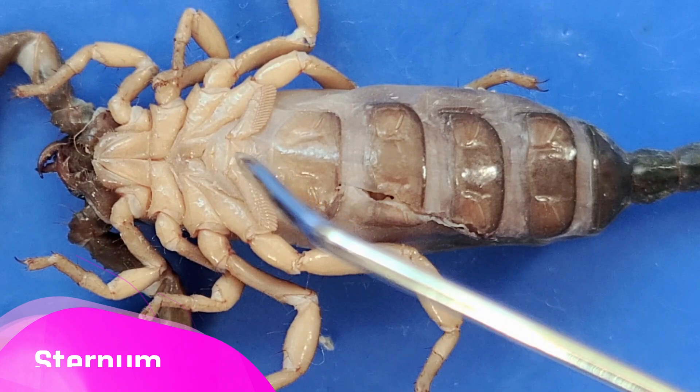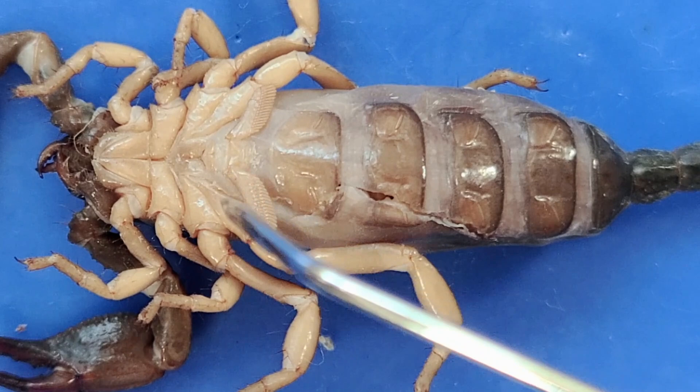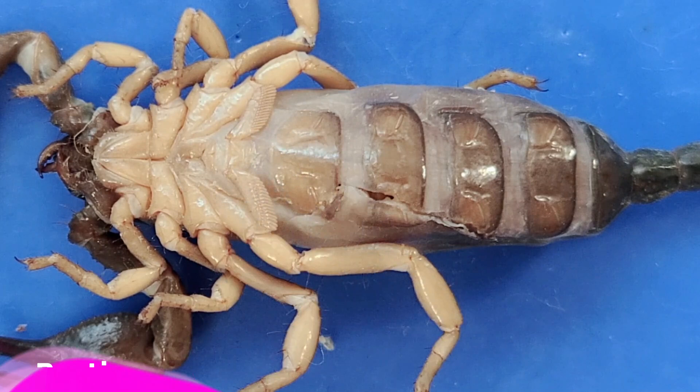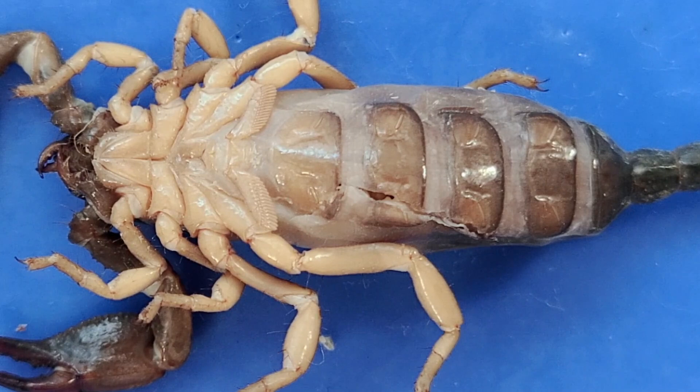Below the sternum is a pair of plates called the genital opercula. In females, these two plates are separate, while in males they're fused to form a single plate. So you can see that this scorpion is male because it has a single fused plate. Now below that, you can see these comb-like structures called pectines, which are used to sense chemicals and movements.